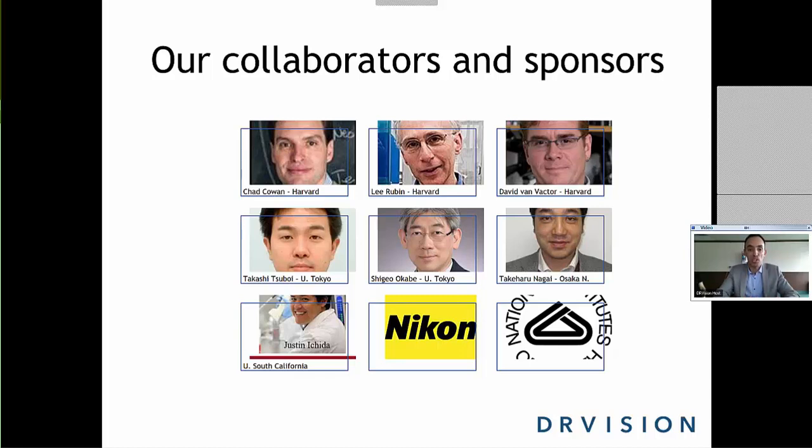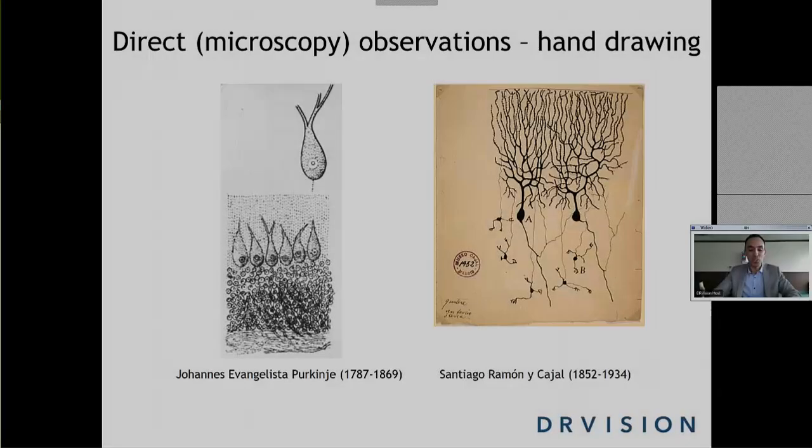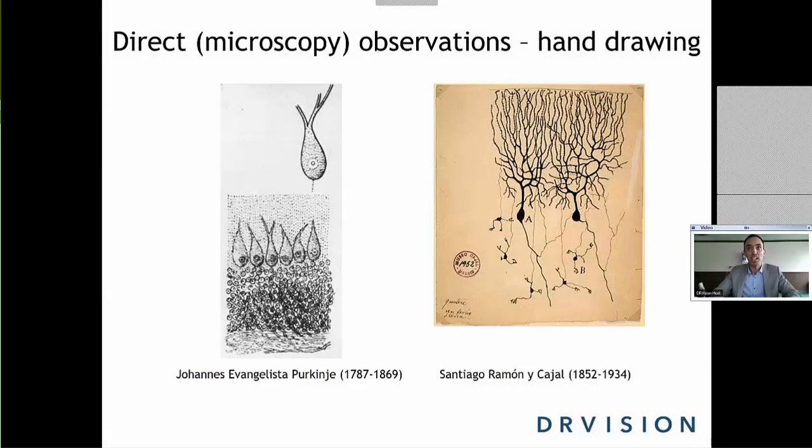We have a few more, and the list is growing in recent months, and we expect that it will continue to grow, and we will be even more active in the R&D, bringing the enabling algorithms that we've developed over the last 20 years and marrying those with interesting biological questions that top researchers have in order to advance science, essentially.